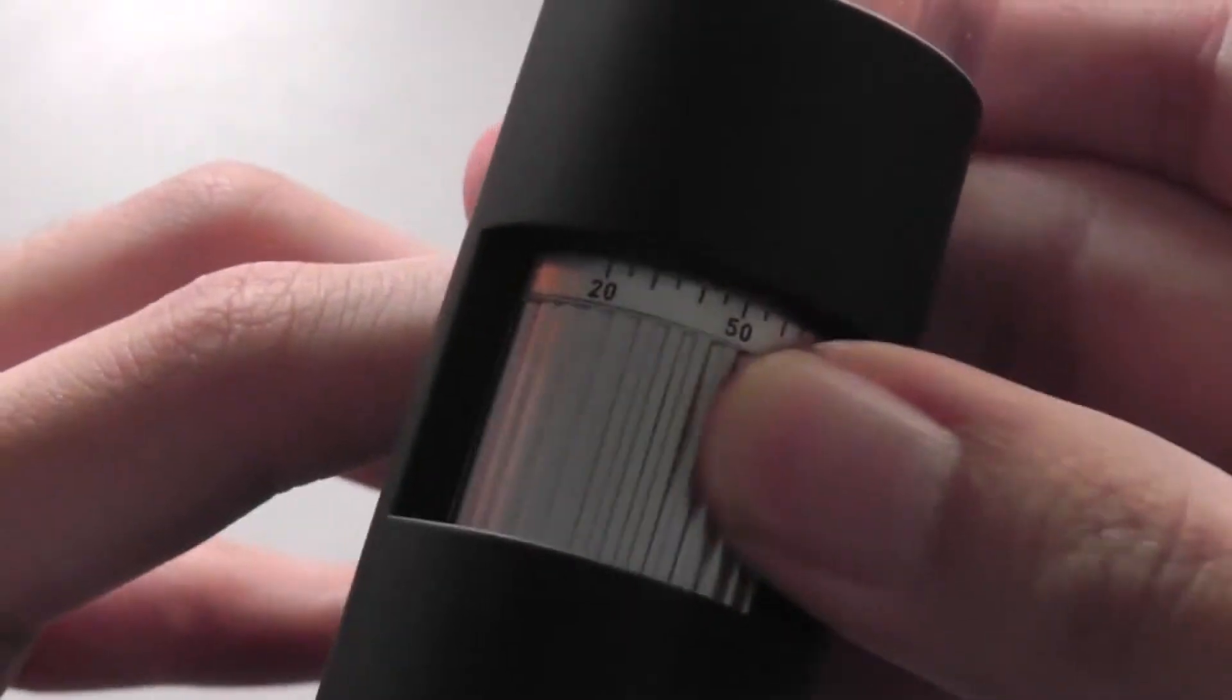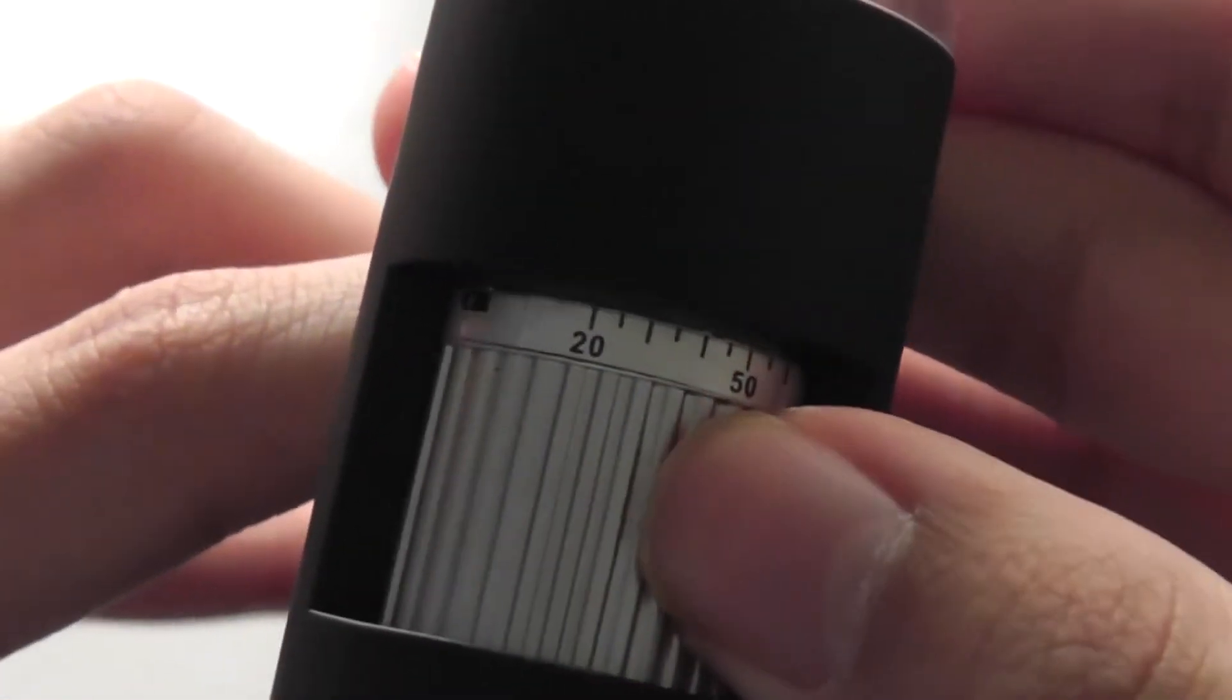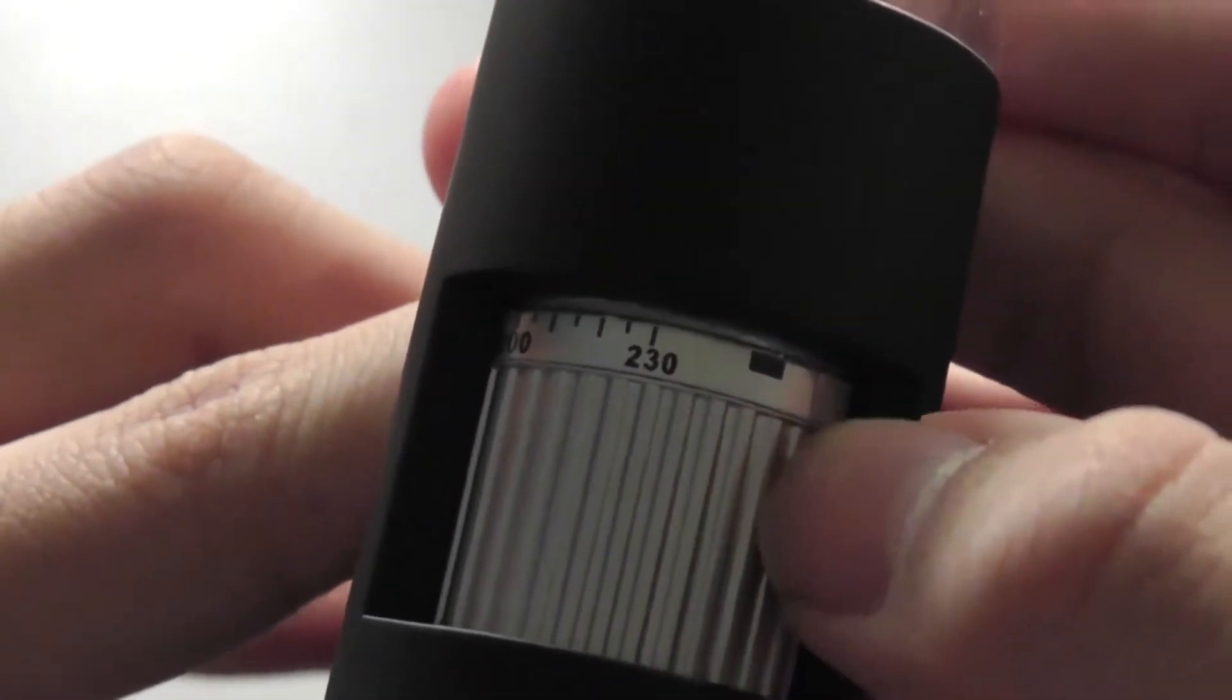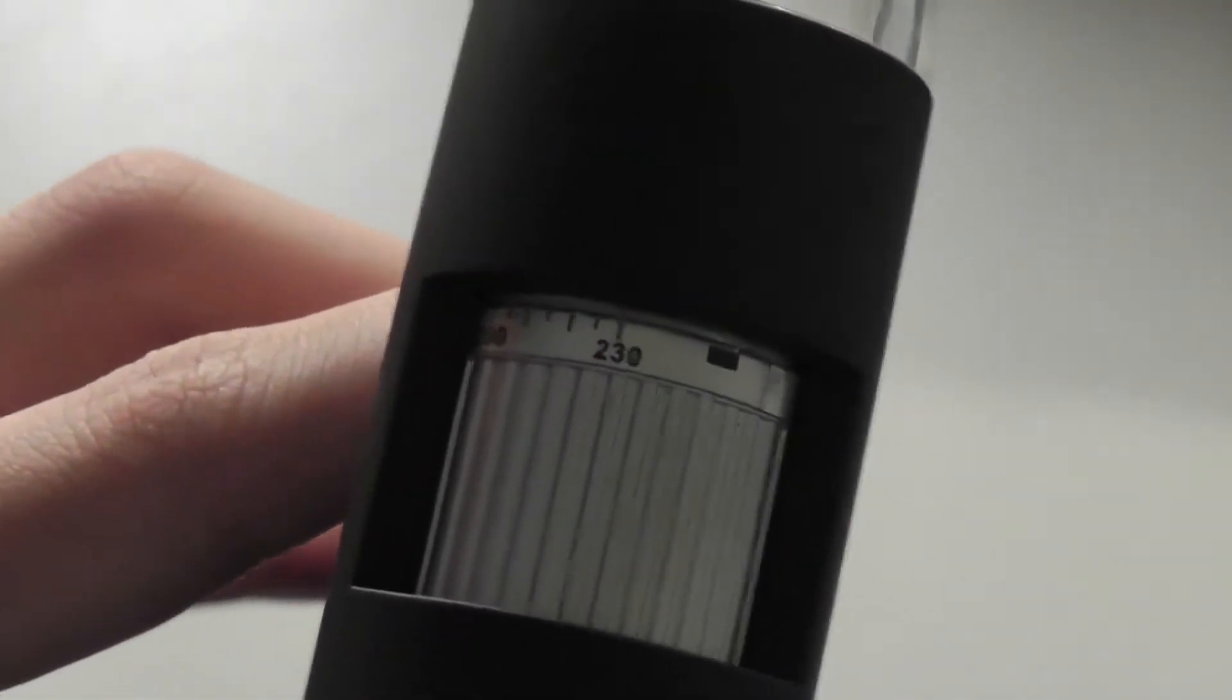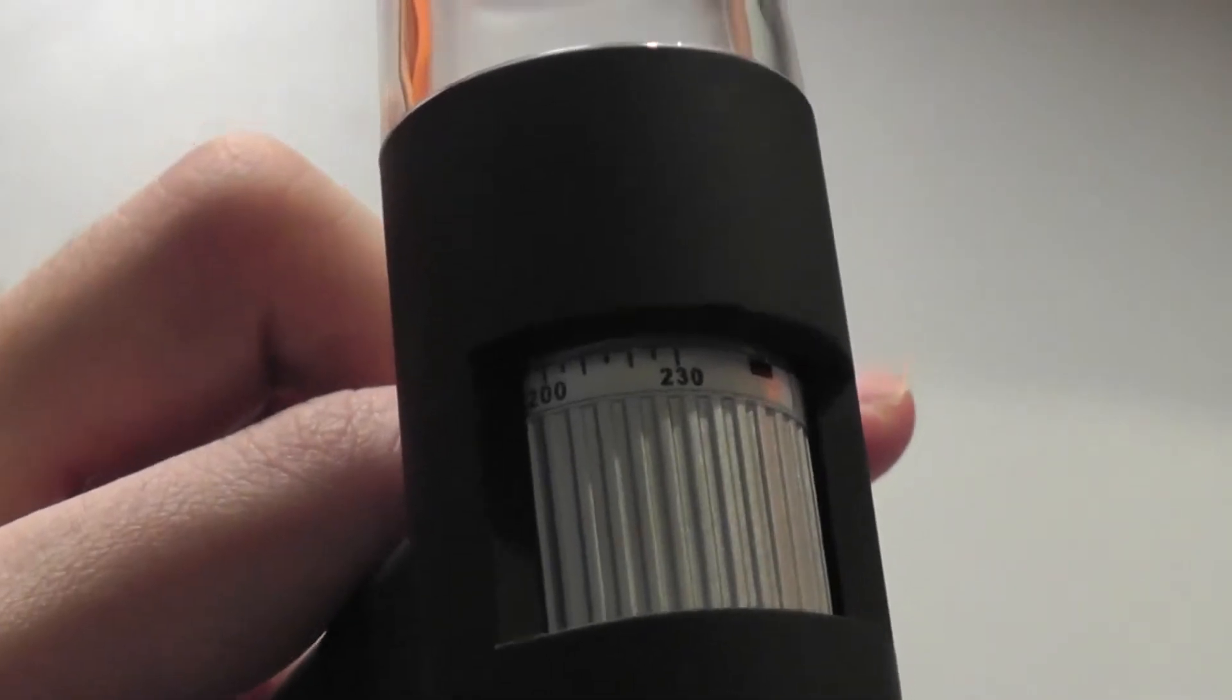It features a left or right scroll wheel that allows you to scroll between 20 times optical zoom all the way up to 250, and allows you to go even higher by magnification using digital zoom.